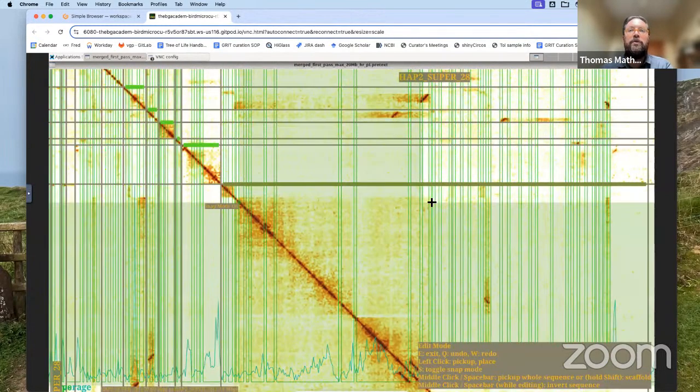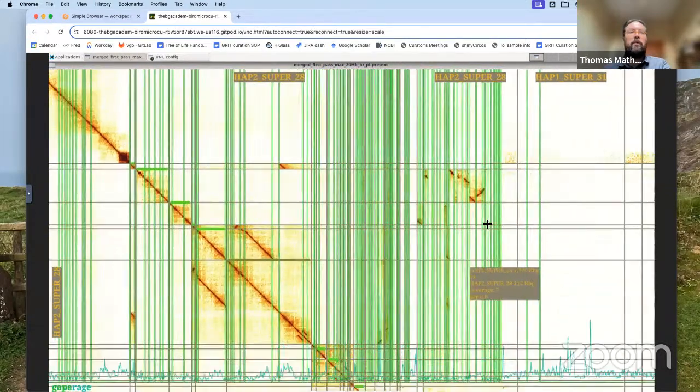So we can see here, there's a big drop off in contacts here. We'll take this whole square, which likely looks like one thing. Move it up. Okay. There's a piece of it here. So this small piece now, where are we? What's going on?